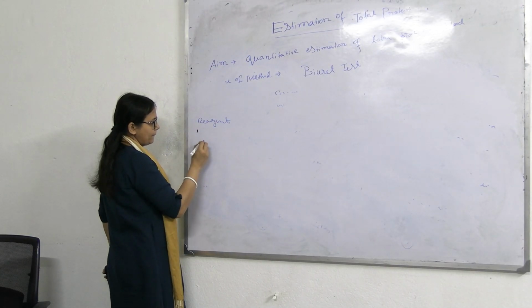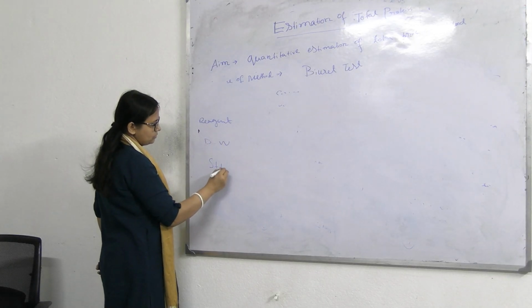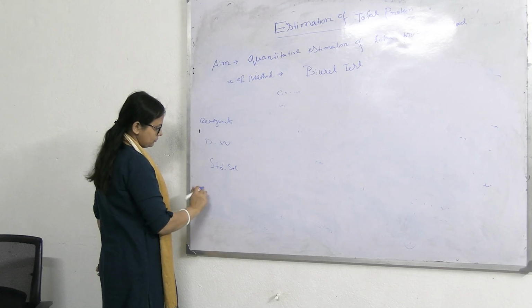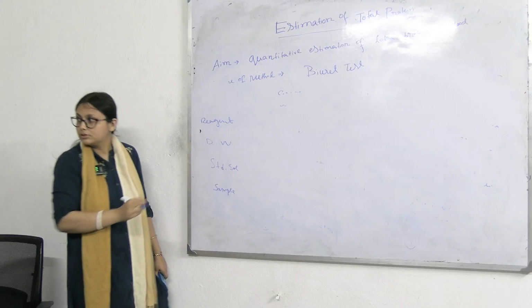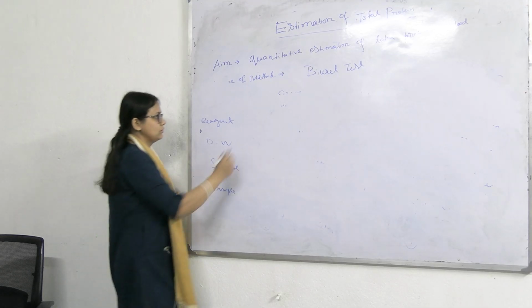Reagent, distilled water, standard solution, then sample. Any problem?